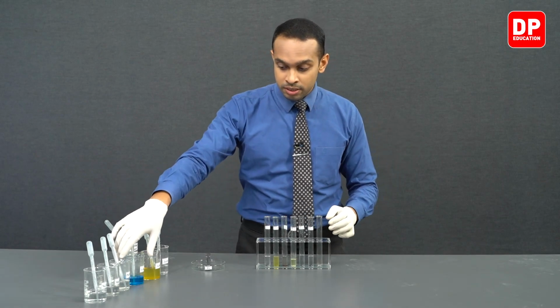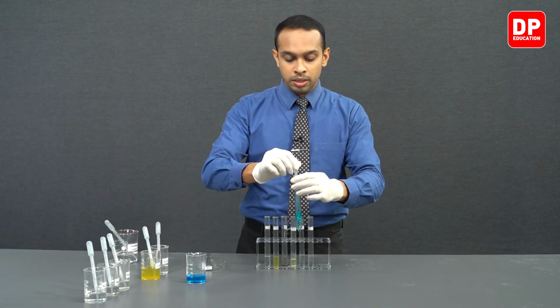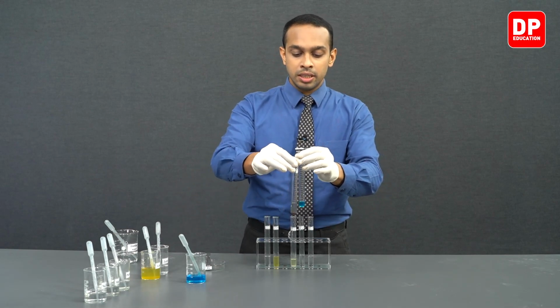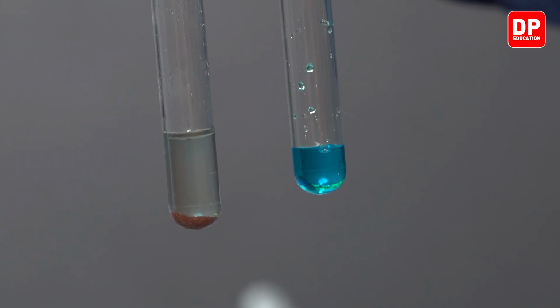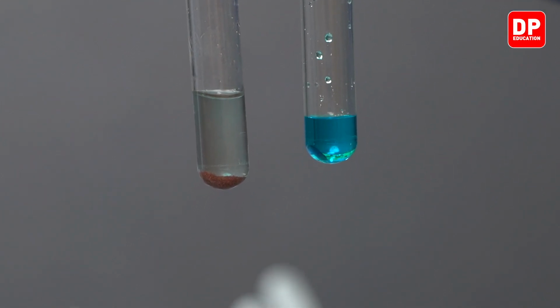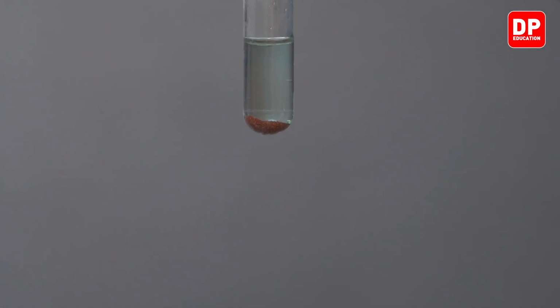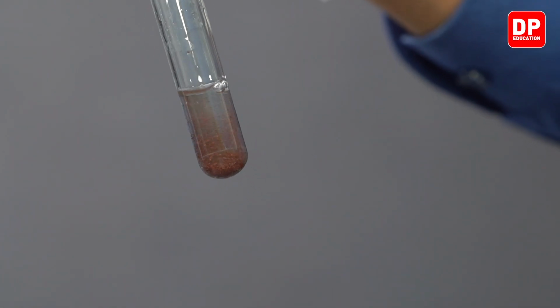And if you take a look at the color difference between the solutions, if you take a small copper sulfate solution into a different test tube over here, you can very clearly see the color difference. The copper sulfate solution is a very clear blue color, but when it comes to the copper sulfate solution added with our iron solid, you can observe the color of the solution that has reacted with iron has decreased substantially, because the majority of the copper 2 plus aqueous ions that were in the medium have now turned into copper solid.